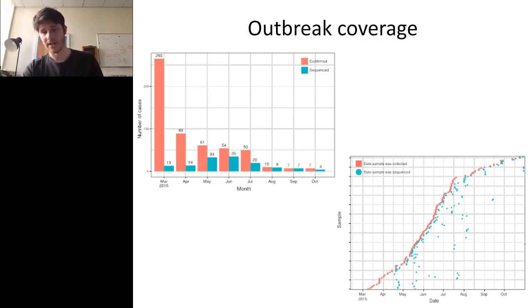And as you can see here, for a number of these samples, that was only 1 or 2 days after the sample was collected. And that just goes to show how powerful mobile labs can be when you consider that the alternative would be that it would be sent back to a lab with a conventional sequencing instrument in, and it might take months before you actually have the data. So that really shows you that the power of a mobile lab can generate data quickly, and it can generate it in a time frame where you can actually still do something about it.